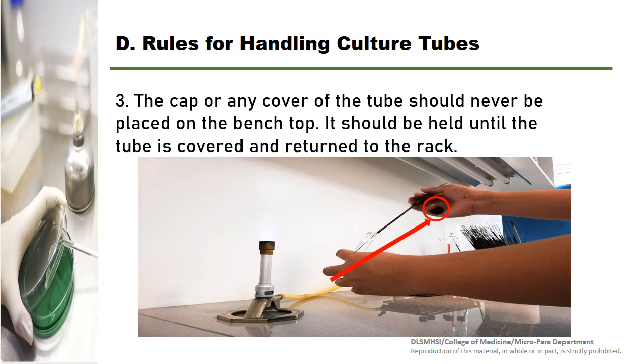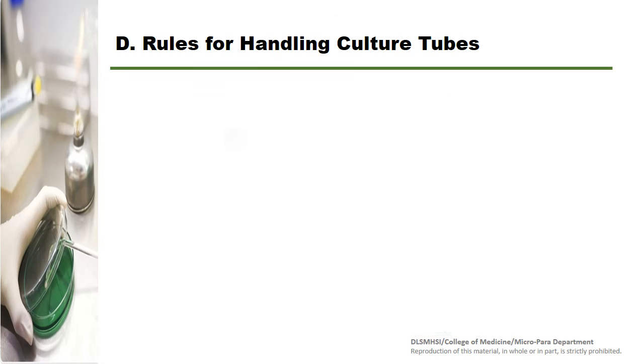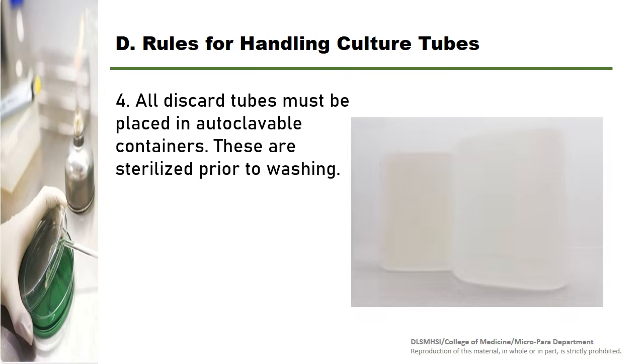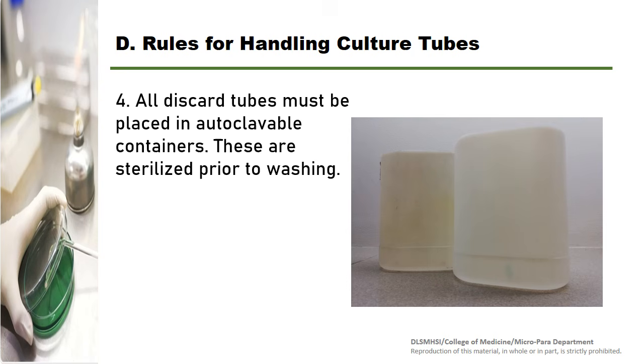So that's what I have mentioned earlier. So you hold your tube cover or cotton plugs using your little finger. All discard tubes must be placed in autoclavable containers. These are sterilized prior to washing.